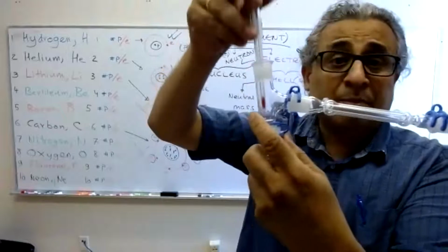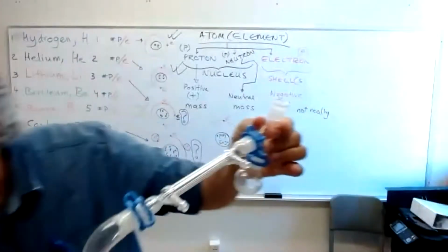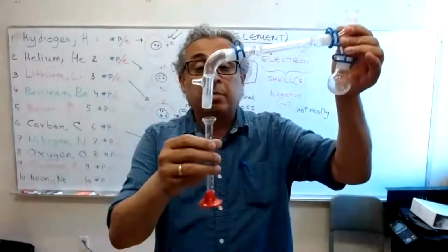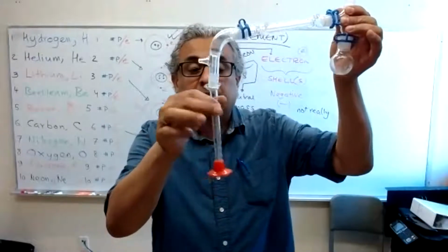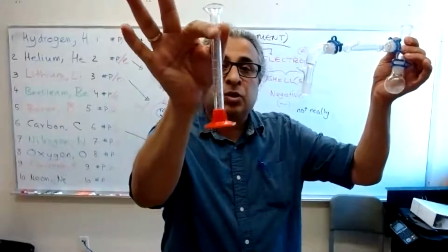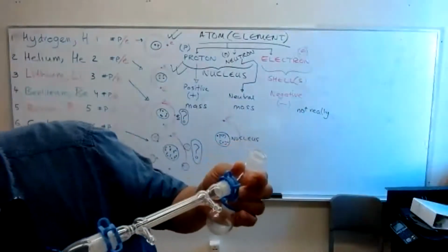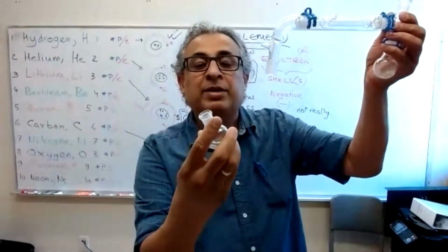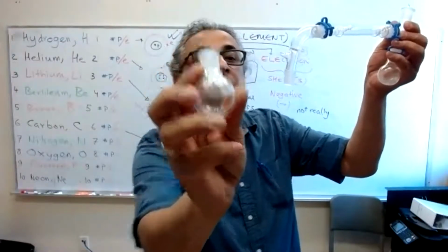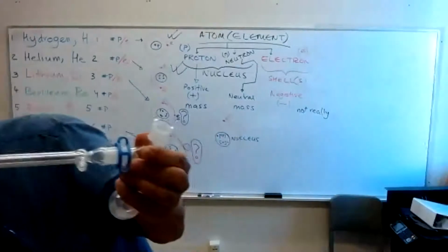Okay, so this pretty much completes the whole distillation setup. As I said, there can be fancy distillation apparatus. You can collect the distillate, what comes out, using a graduated cylinder. This is a graduated cylinder. We joke that it already has an undergraduate degree. I didn't bring the bigger one. Or you can attach a round bottom flask; again, they're not meant to be together. This is 14/20 and that's 19/22, so they don't fit. It's too small. I don't have another flask, but you get the point.